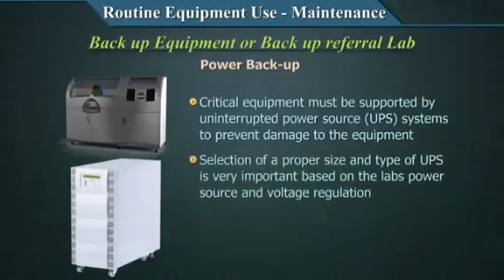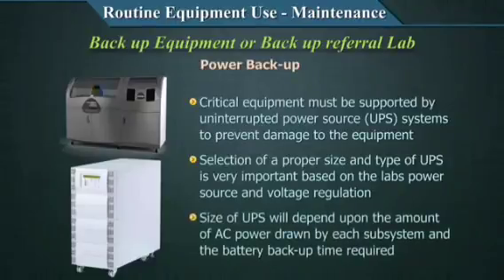Selection of a proper size and type of UPS is very important based on the lab's power source and voltage regulation. Size of UPS will depend upon the amount of power drawn by each subsystem and the battery backup time required. Two important considerations: the amount of power drawn by each system, each equipment, air conditioners, whichever you are using, and the battery backup time required.